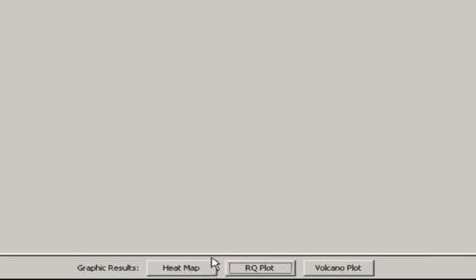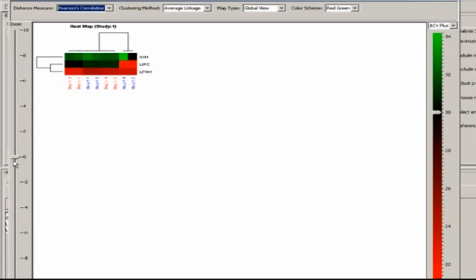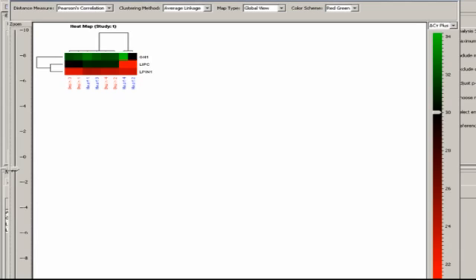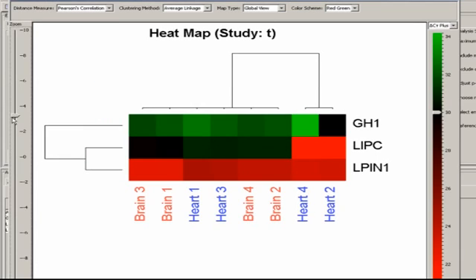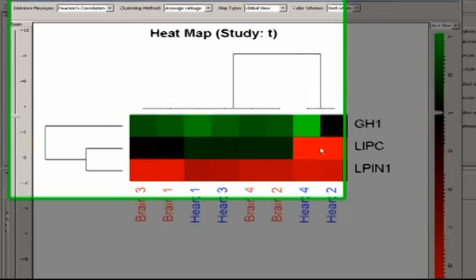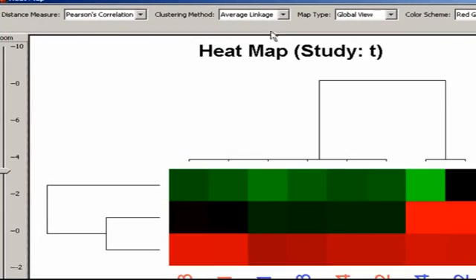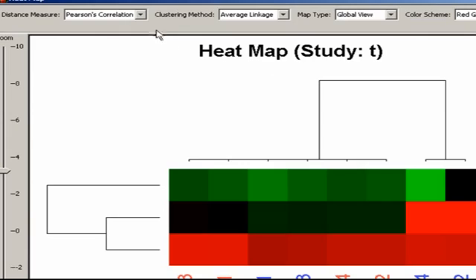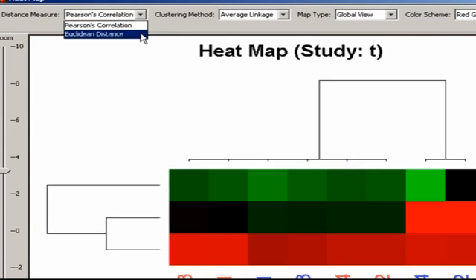Finally, the heat map. You can expand or contract the view, like this, to make the plot bigger or smaller. Now, these can be fairly complex, so I'd encourage you to work with a biostatistician in order to make the best use of these dendrograms. Essentially though, the plot displays hierarchical clustering of both samples and genes, based on your chosen clustering method: average, complete, or single linkage.